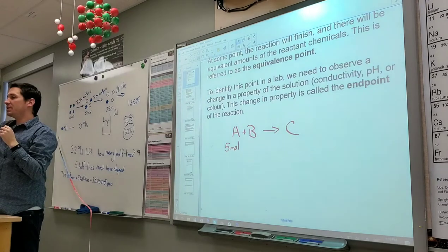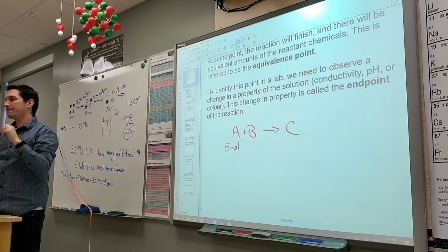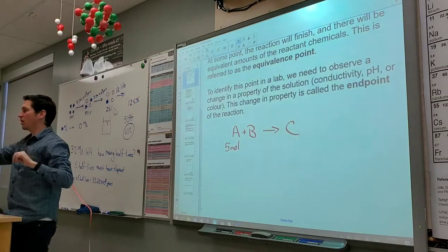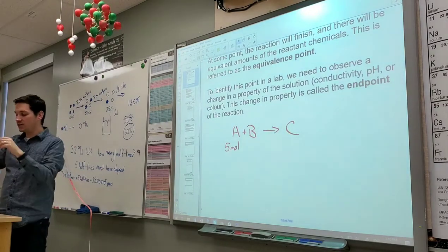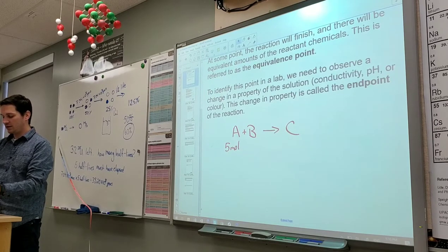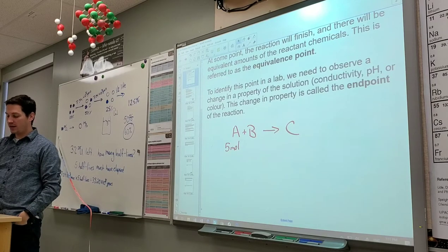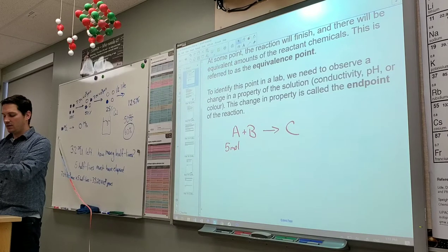What's going to happen to this level of water as I open the stopcock? Down. The volume of water is going to drop, right? So the readings are going to change. And so as I add my acid to here, I can slowly add it or quickly add it, whatever, okay?